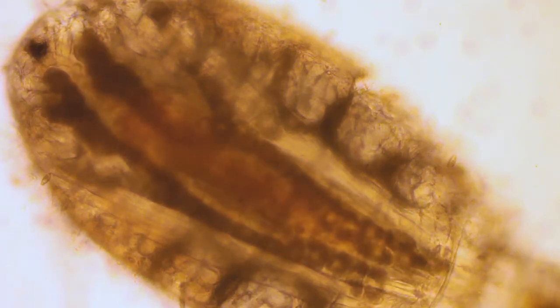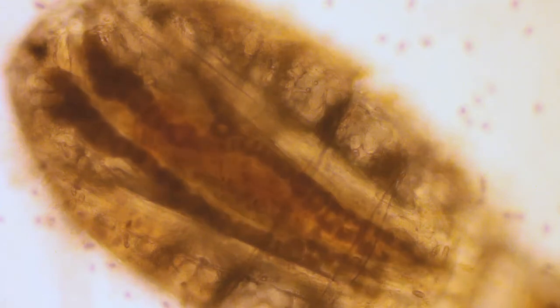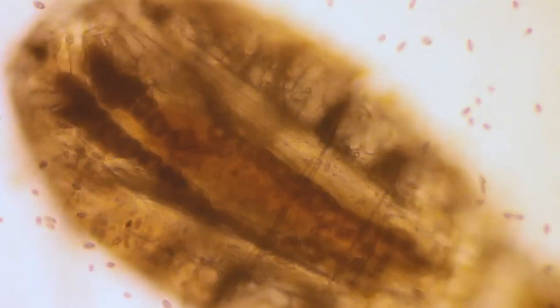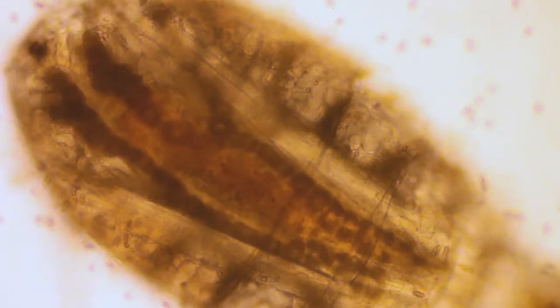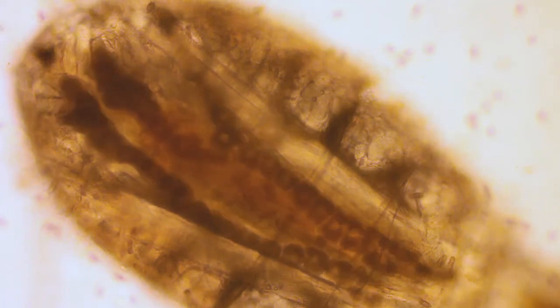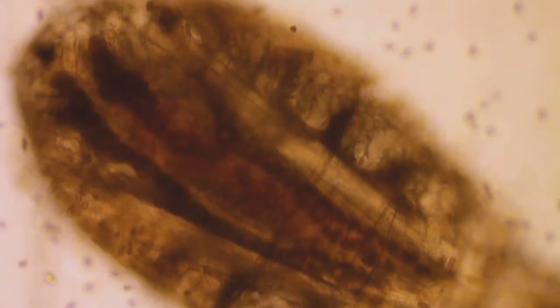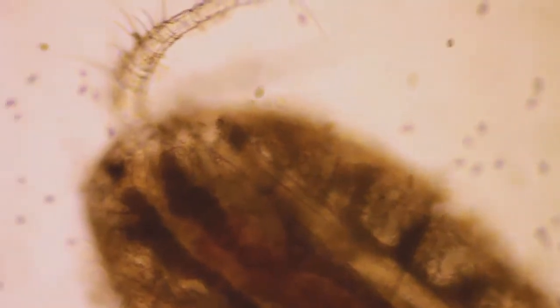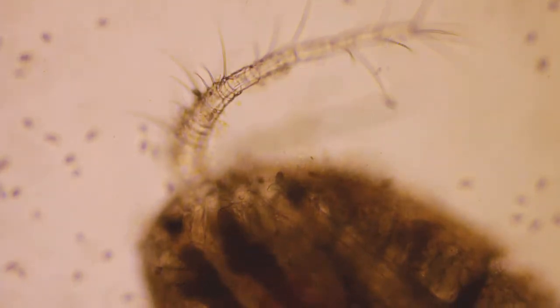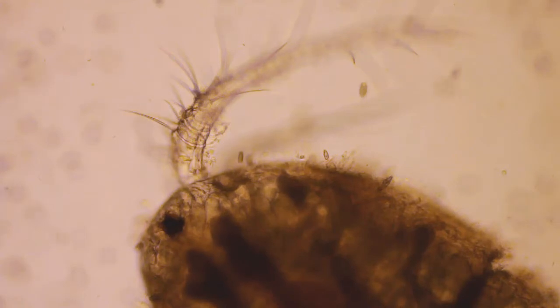We're looking at a Cyclops at 10 power, looking right into him. That's his guts and internal organs. I think he's pretty much trapped — I have a depressed slide here but I think he's trapped, still too fat. So he's trapped between the cover slip and the slide.